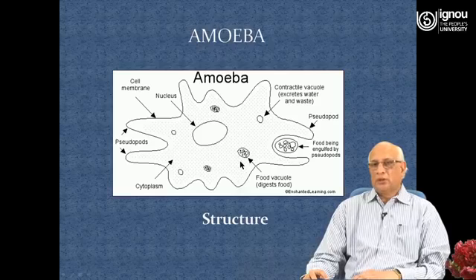So, we can compare this activity with the circulatory system of the higher animals. As you know, in higher animals, it is the responsibility of the circulatory system to distribute the digested food to all the parts of the cell. So, here this duty is performed by this food vacuole, because it is moving in all directions and the absorbed food will be distributed inside the protoplasm.